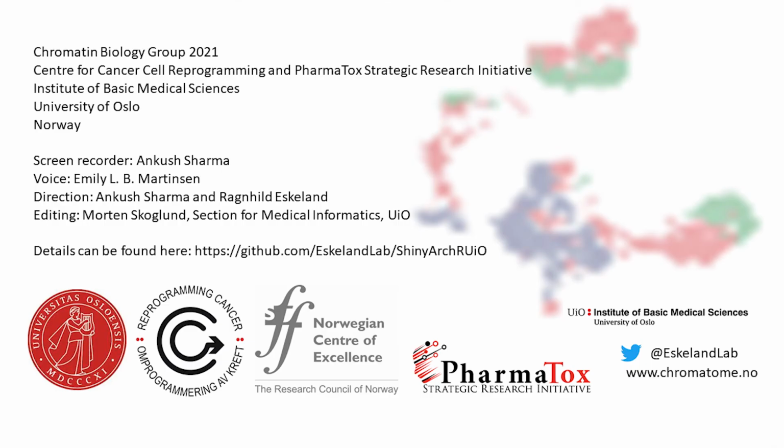We have presented ShinyArchR.UiO, an app that adapts pre-processed ArchR data of single-cell ATAC-seq for intuitive genome-wide exploration and sharing to make the data available for a collaboration group or larger audience upon publication.